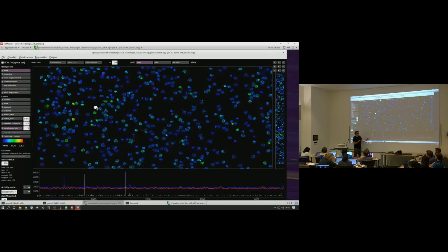That's actually really hard to get from single cells, to know exactly, even on average, how much df over f should correspond to one spike. So we can't tell you that there's 20 spikes here and 1 spike here. But what we can tell you is that there's probably roughly 10 times more spiking here than here.